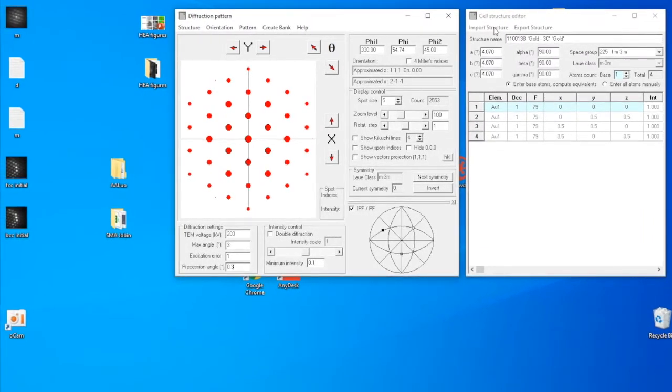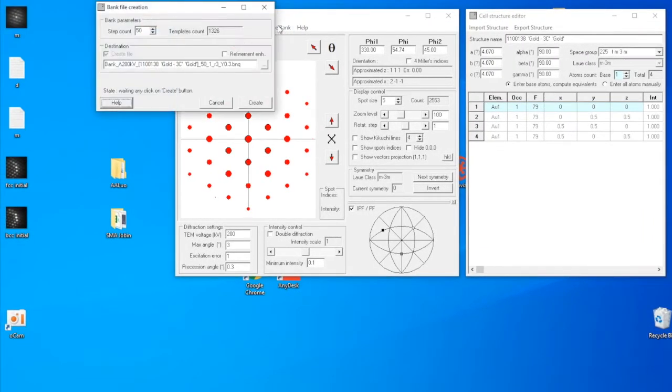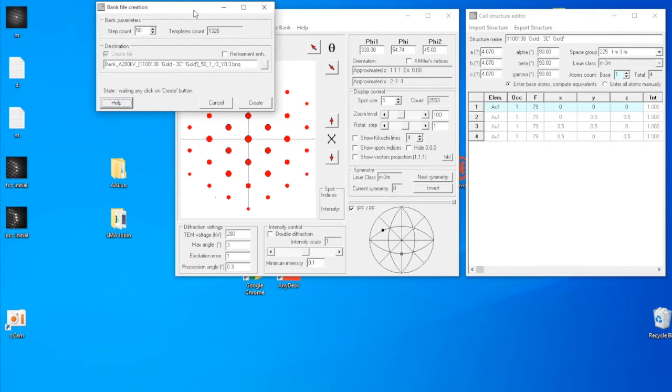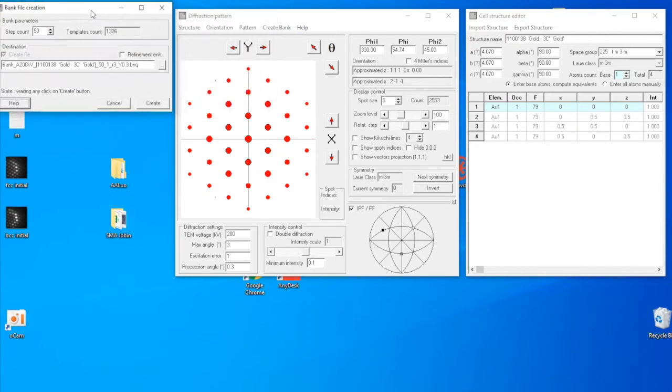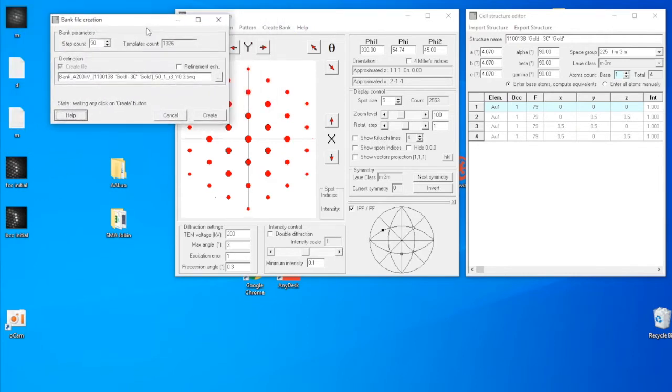You click on create bank, and a new window will appear called bank file creation. By default, the step count is 50, the corresponding template count is 1326. The template count can be viewed as how many diffraction patterns you simulate, which will be compared to the experimentally acquired data.